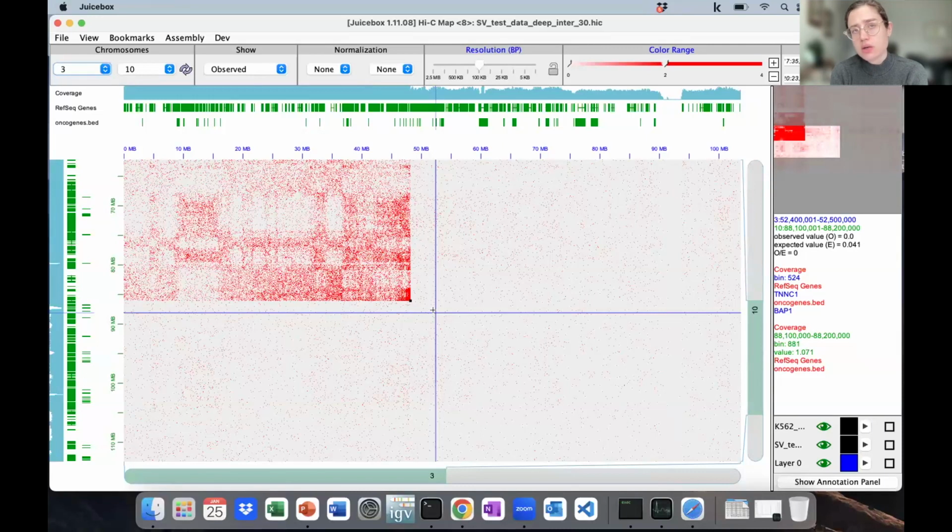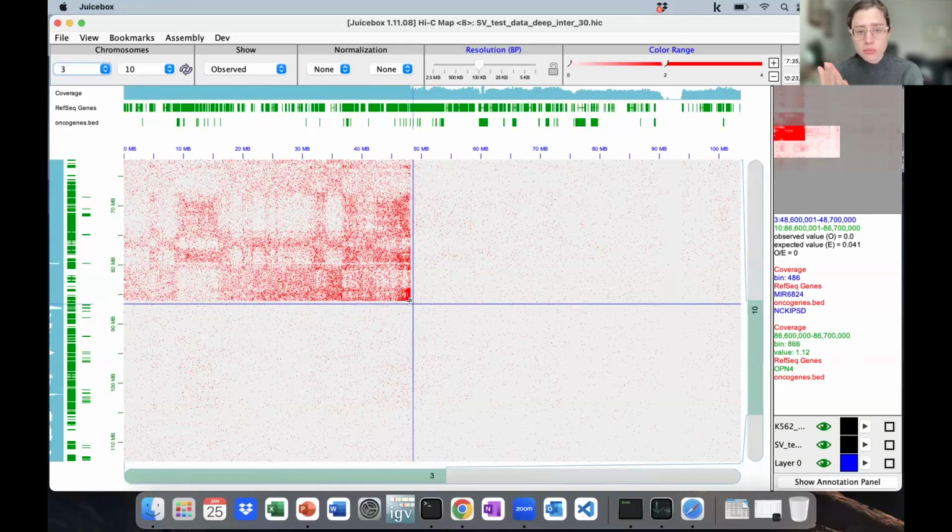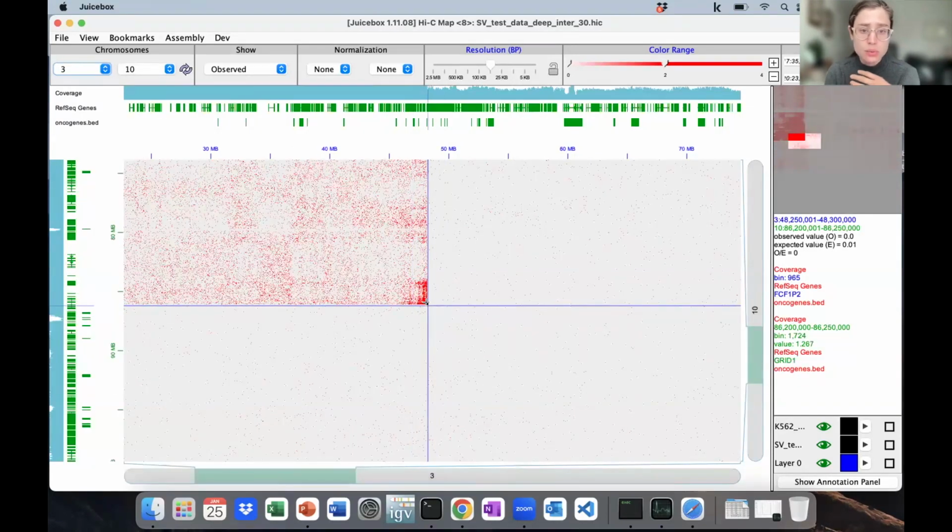So HiC Breakfinder might give you some false positive calls. So not all the calls you might see on our Arima Bioinformatics platform might be real SVs. And not to worry, we can always review them right here. And what are the characteristics of a true positive, a real structural variant, the way we have been seeing them at Arima? So we want to see very clean edges, right? So you can determine where your breakpoint is with accuracy. So if you see clean edges, that is a plus.